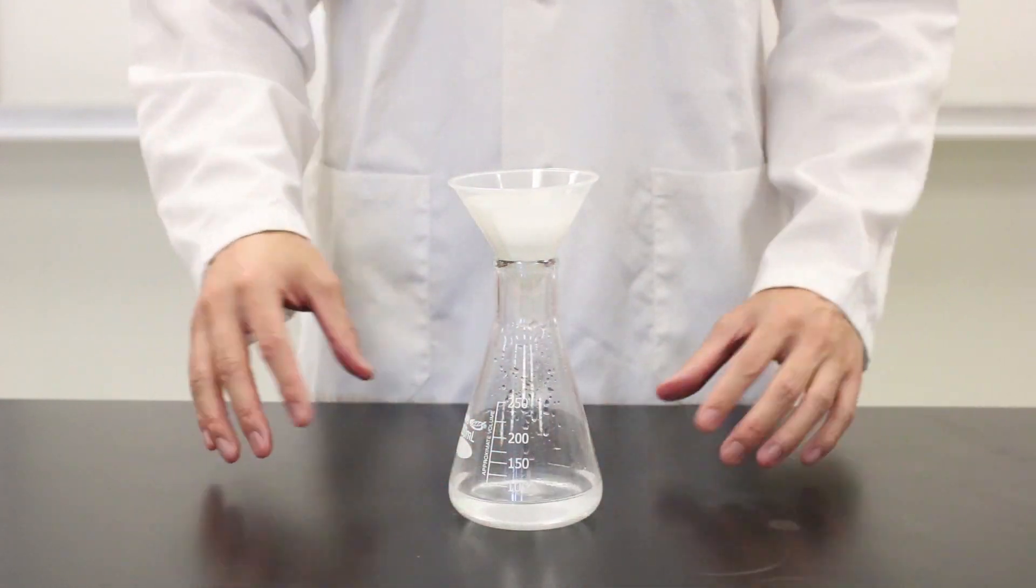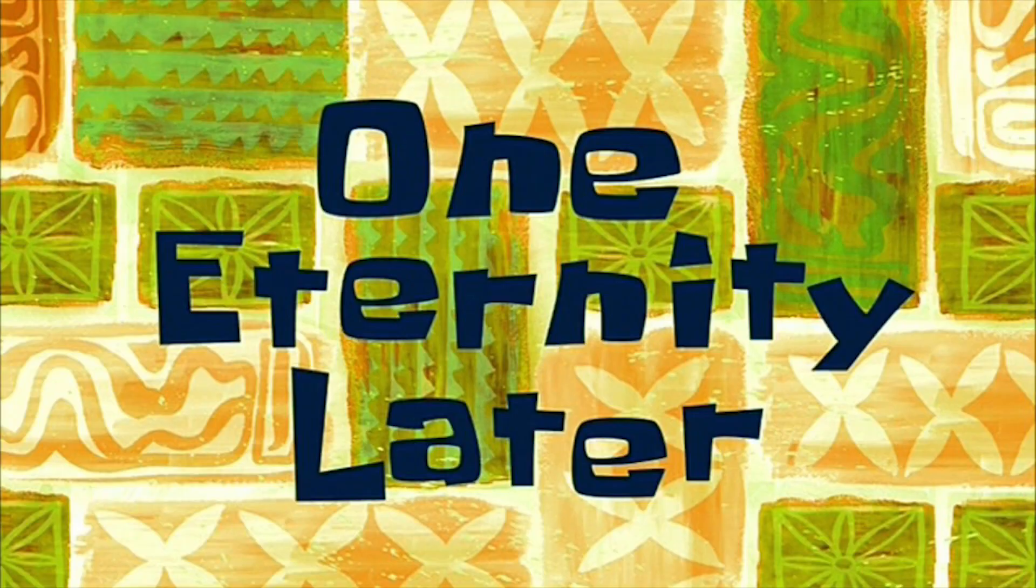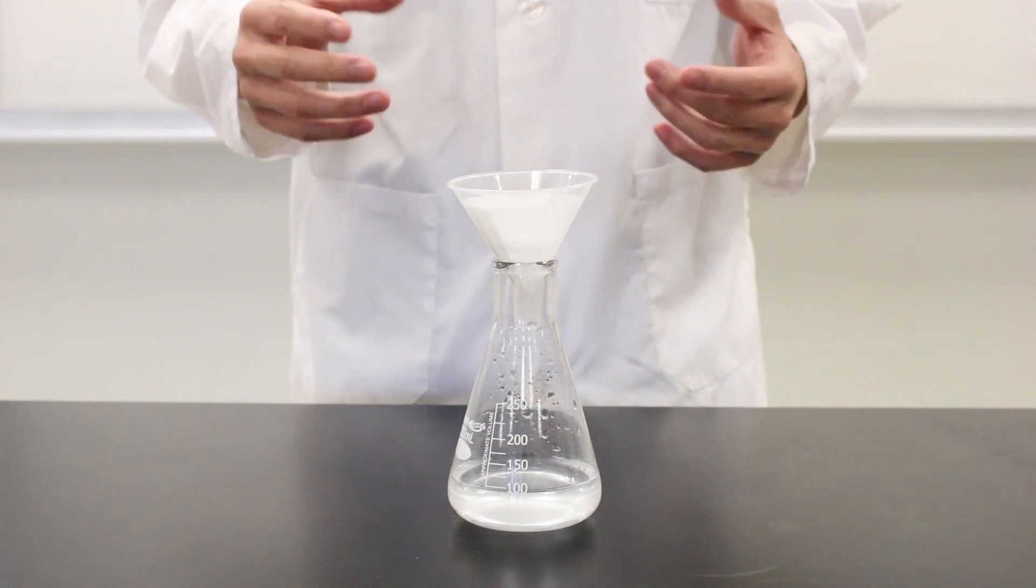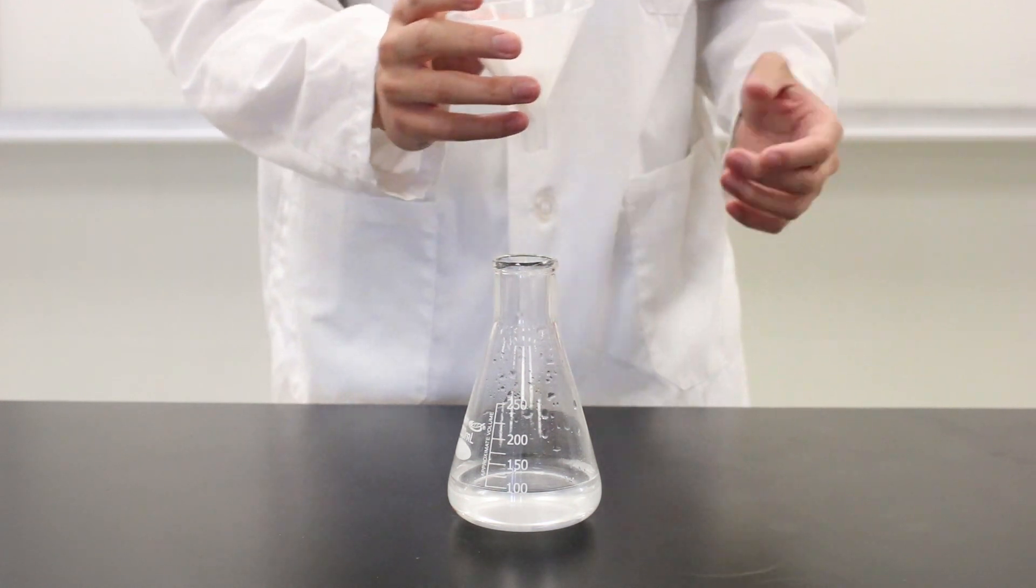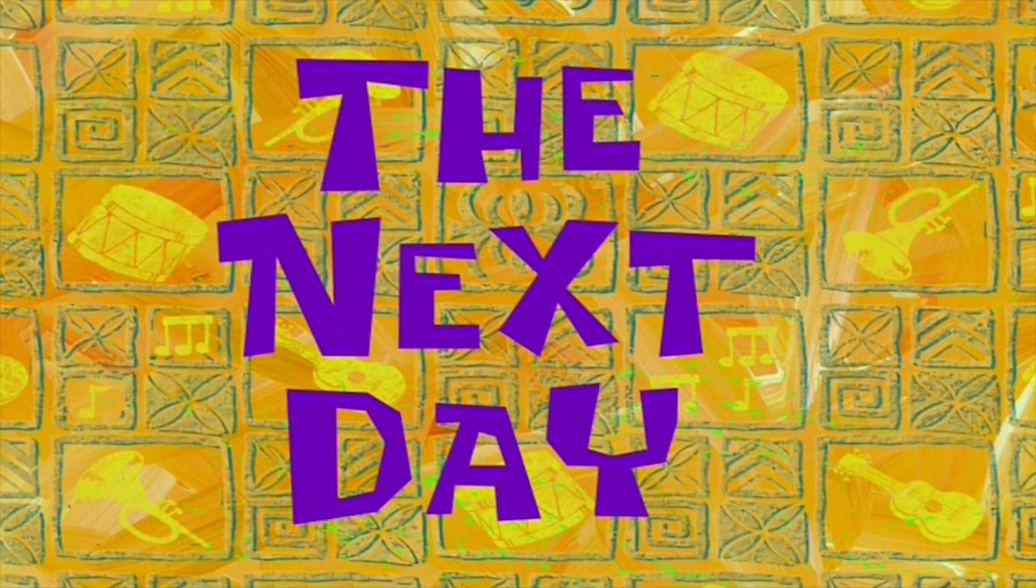And now we wait just one last time. One eternity later. Alright, it looks like all the water has filtered through, so I'm going to leave it overnight and it should be dry by tomorrow. The next day.